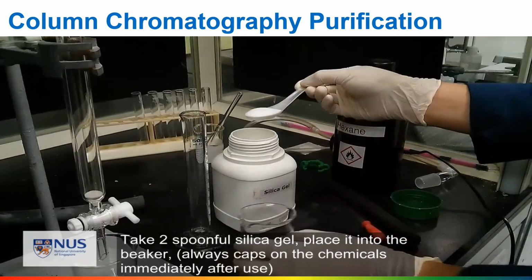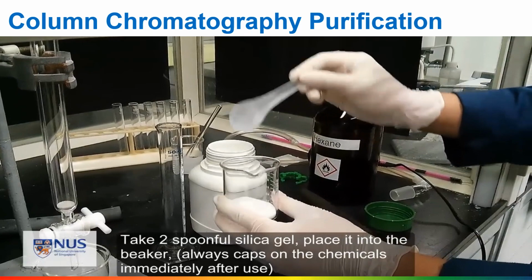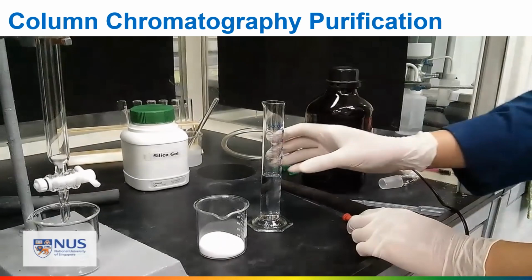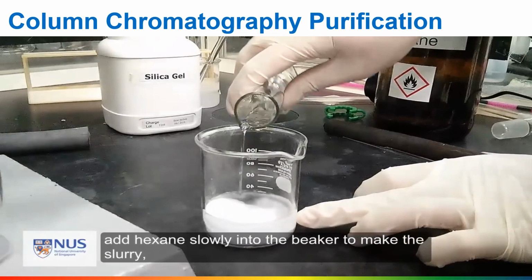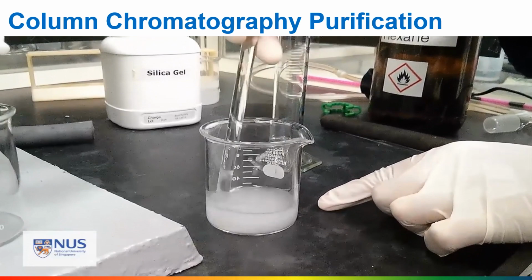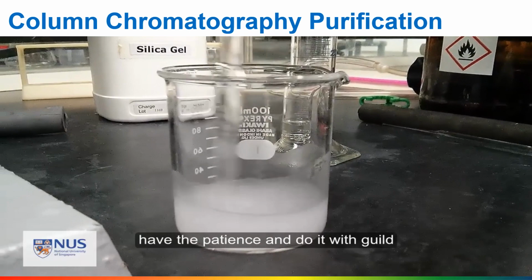Take 2 spoonfuls of silica gel, place it into the beaker. Always put caps on the chemicals immediately after use. Add hexane slowly into the beaker to make the slurry. With the glass rod, stir it well to evacuate any air bubbles trapped inside. Make it into a homogeneous slurry.